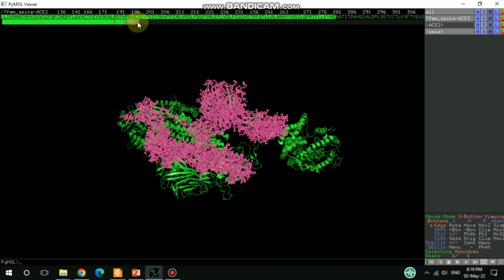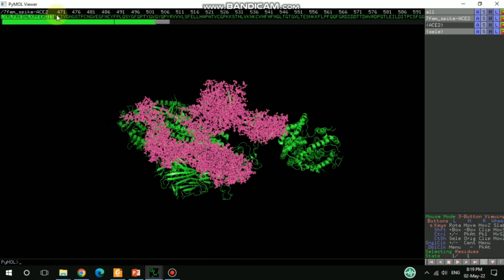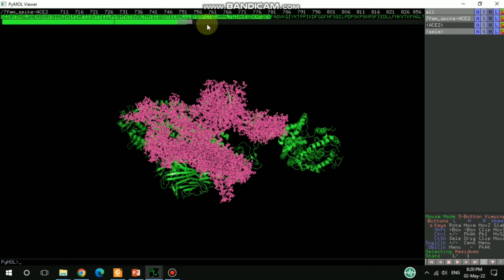It's almost done. For the selection of these two different proteins, separating them by color will give a better understanding. And if you present somewhere, or if you would like to use this model for your publication purposes, then it is also better to distinguish them by color.